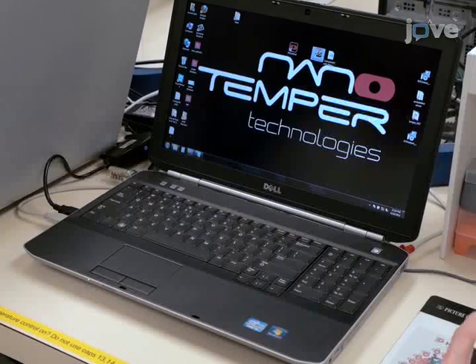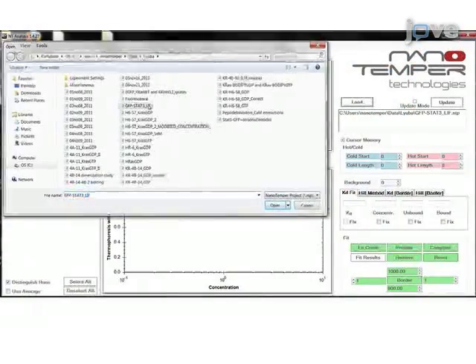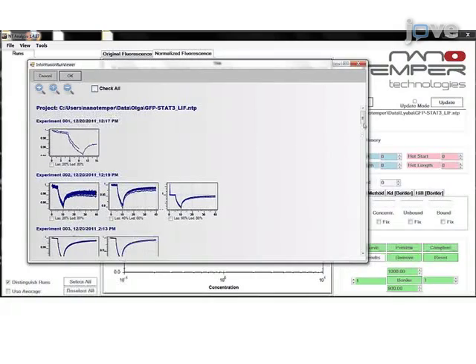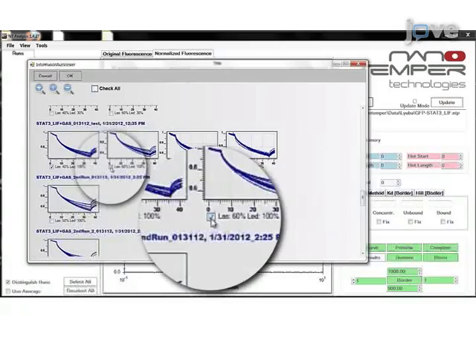To begin data analysis, open the analysis software and load the project folder. In the appeared Information Run viewer, select Collected at a specific IR laser power thermophoretic curves. There is an option of opening all thermophoretic traces collected under various conditions at once, and then choosing any curves for analysis by switching them on and off.